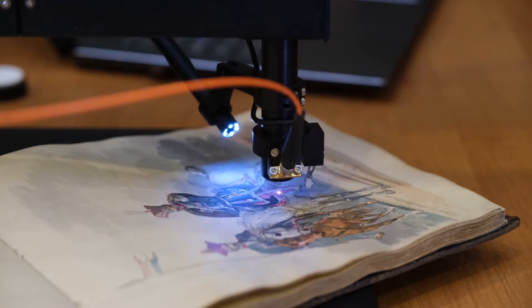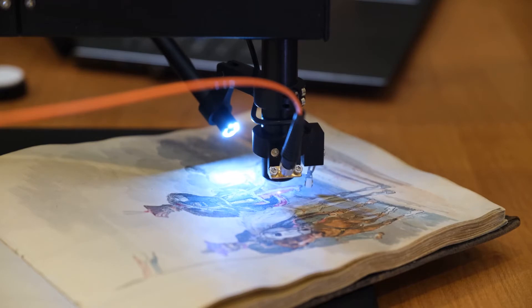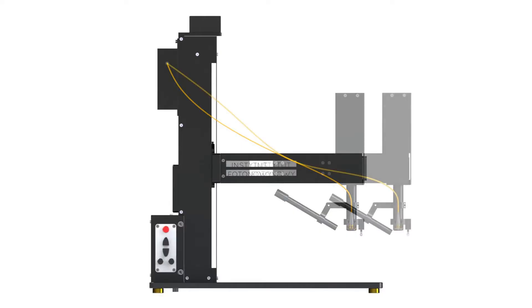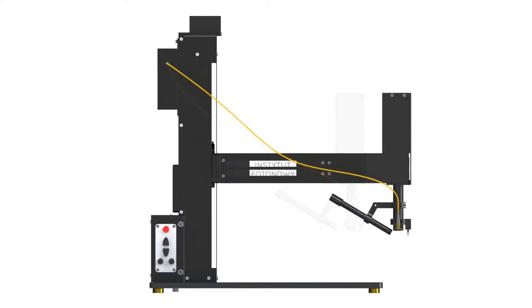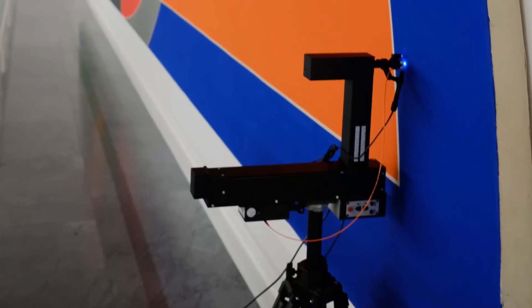The macro camera may take images of the area being investigated. For large objects, an extension arm or tripod mounting are available.